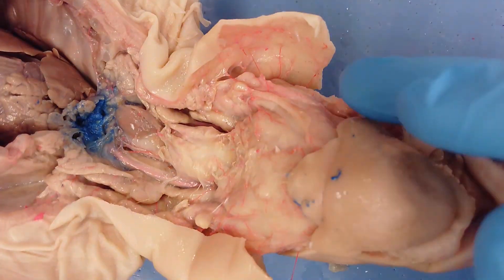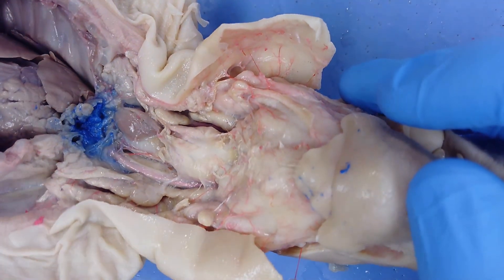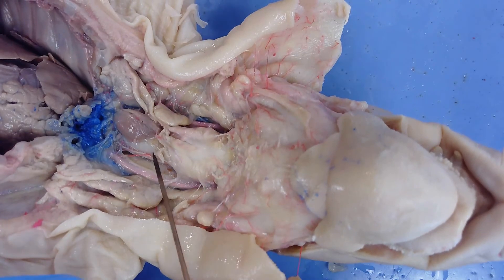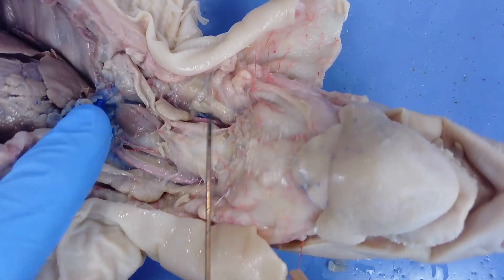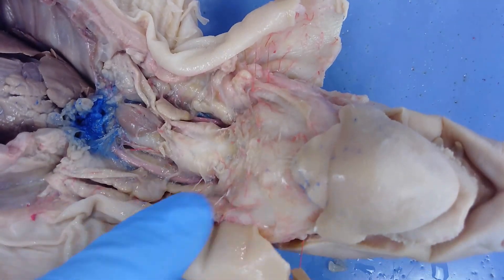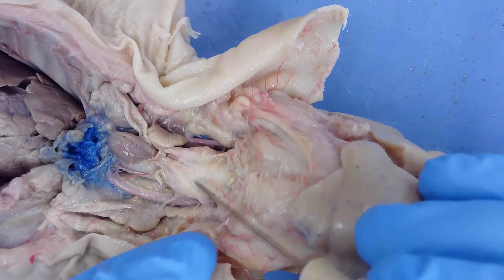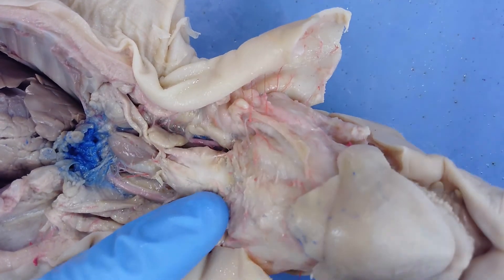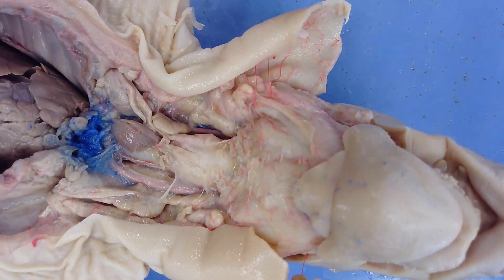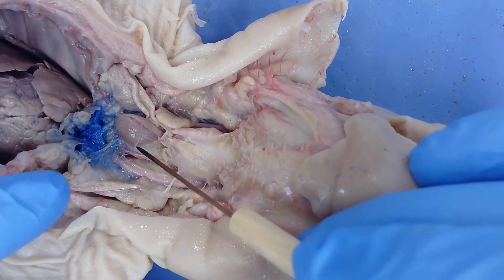The next step was to open up the pig by making a cut from the chin down the length of the body to the umbilical cord, then cutting around it. This exposes the respiratory and digestive systems up to where they connect to the epiglottis and esophagus. Right here we have the larynx, which acts as a voice box and is part of the respiratory system. Air travels from the epiglottis and glottis into the larynx.